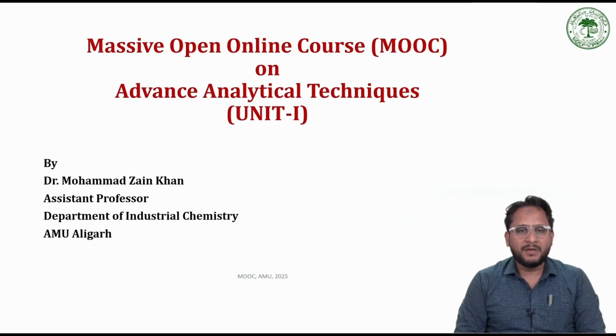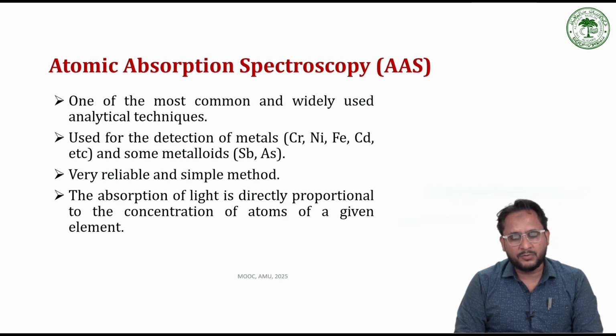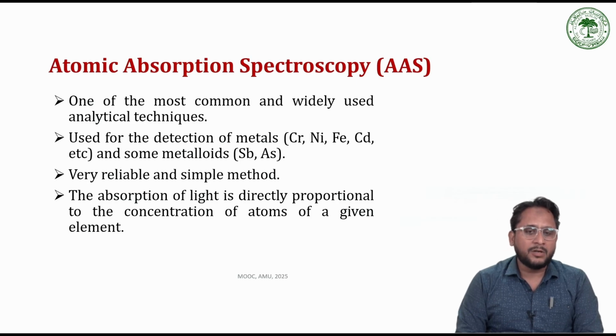Welcome back to the massive open online course on advanced analytical techniques. In the previous lecture, we have gone through the concept of spectroscopy as well as the difference between absorption as well as emission spectroscopy. We have briefly discussed the components of atomic emission as well as atomic absorption spectroscopy. In this lecture, we'll talk in more detail about atomic absorption spectroscopy.